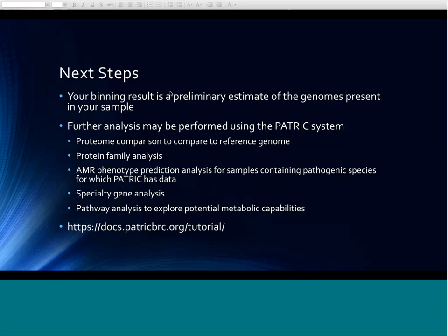Okay, here's another one. There are only 10 eukaryotic systems available in PATRIC. Are you planning to include plant genomes in PATRIC in the future? I don't.